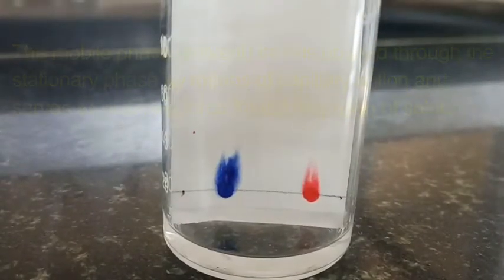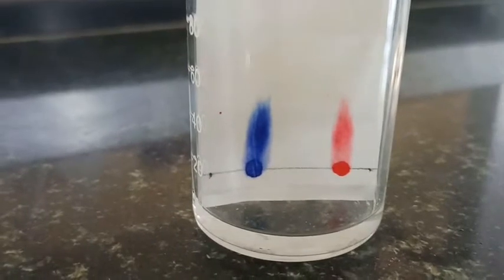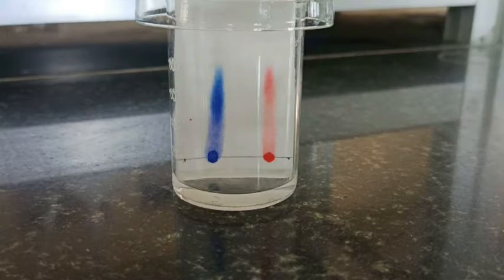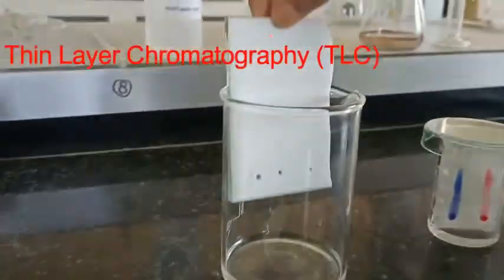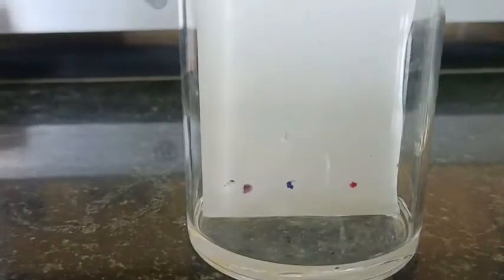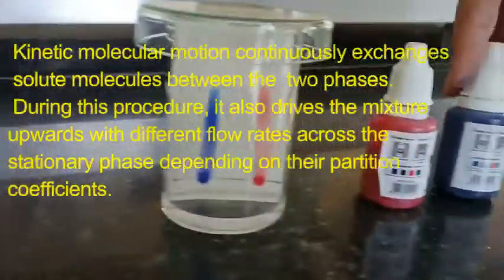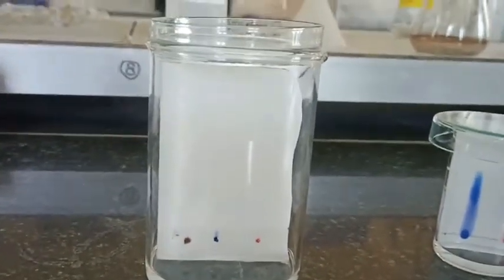You can see the solvent is moving upwards by capillary action, and this carries the solute upward. Similarly, we have put the sample on the glass TLC plate and kept it inside the chamber as well. One important thing — if you are using organic solvents, always keep your chamber closed so that the solvent does not evaporate and its composition does not change over time.